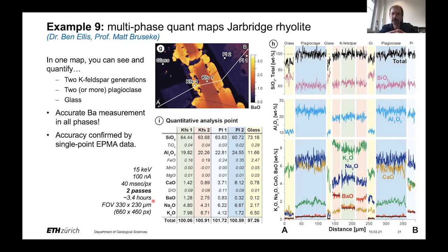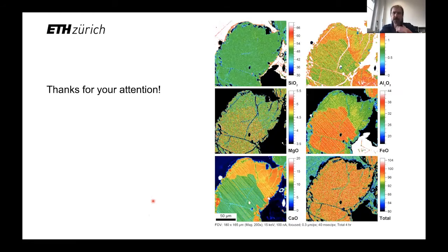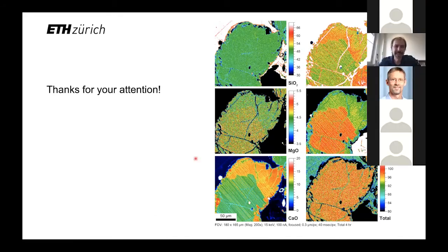And I tried also to get some strontium data, but in these samples, we didn't get so much strontium. So the maps were pretty useless. So I'm going to leave you here, just throwing in this pyroxenic solution, which is another quantitative map. And I just put it there because indeed Ben might want to publish something about that. We'll see. All right. Thank you for your attention.